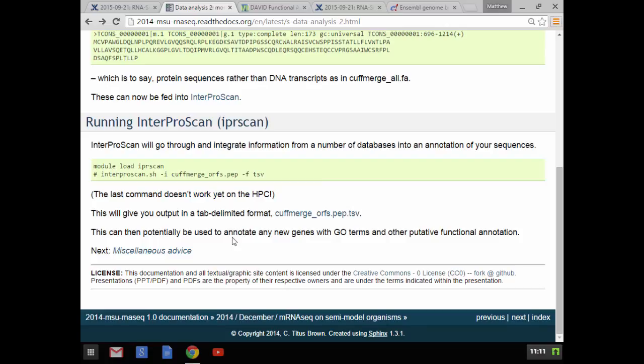You're still going to have a list of all of your peptides from all of your genes, and you're going to have to decide which ones of those are actually differentially expressed and try to combine that information with information from your InterProScan output and make a brand new analysis based on which genes you think are interesting, which genes might actually be useful. And all of that is going to be dependent on what your project is, what your time frame is, how much effort you want to apply to finding out what a new protein does versus working on proteins that already exist, because you don't have time to do molecular toolkits and change proteins and all of that work if that's where you're at.